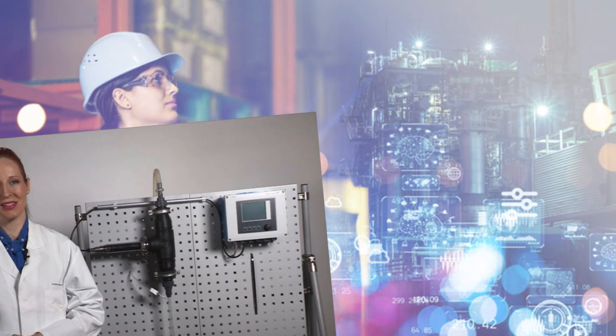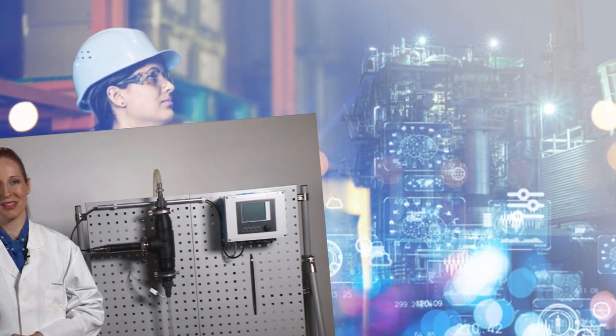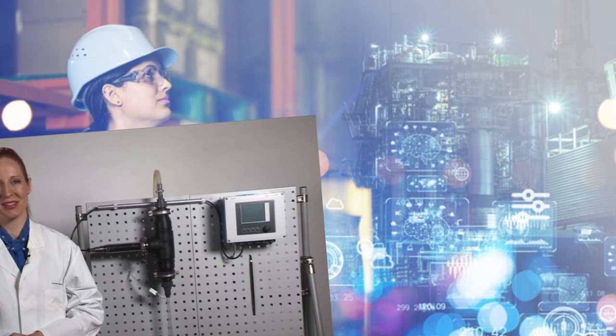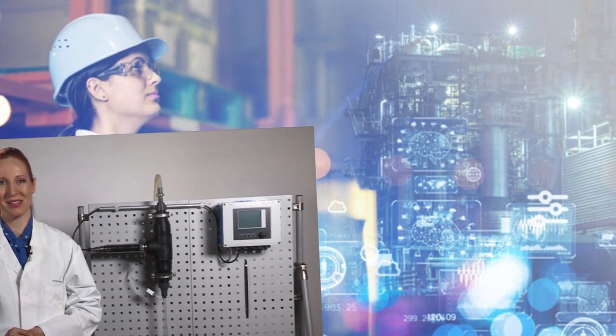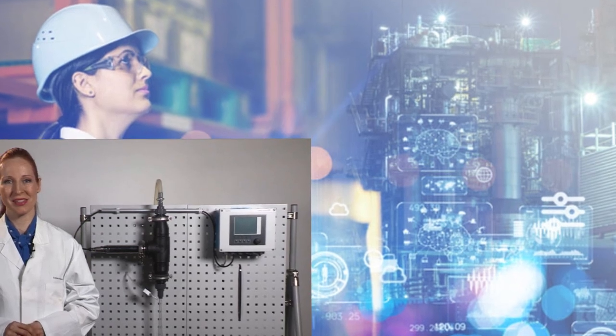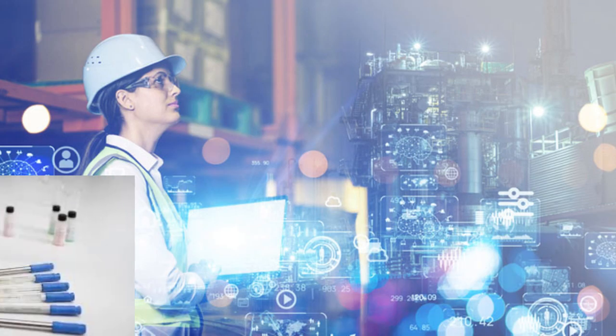Well, imagine a beam of light shooting through some water. Any particles in the water will scatter that light. And the CUS52D measures that scattering. So more scattering equals higher turbidity. Basically, how cloudy the water is. So if I'm getting this right, a clear mountain stream would have very little scattering, while a muddy river after a rainstorm would have a ton, right?